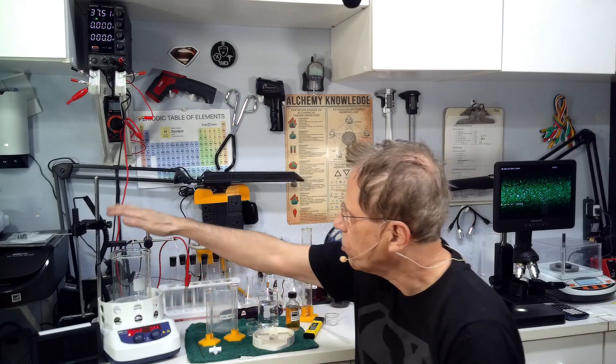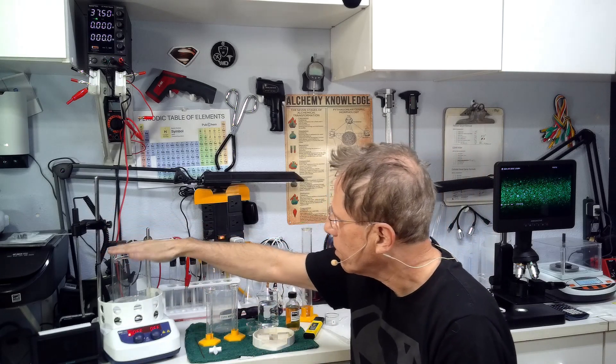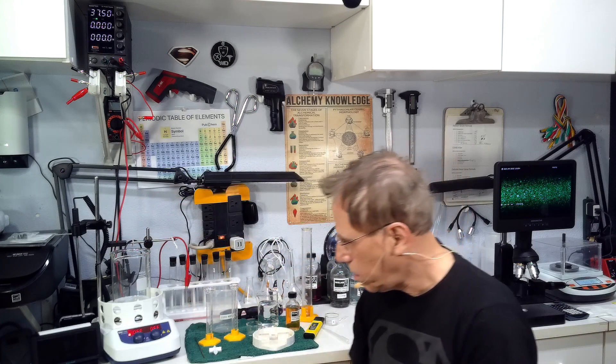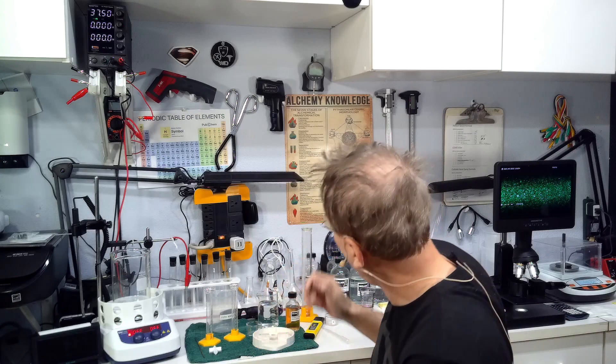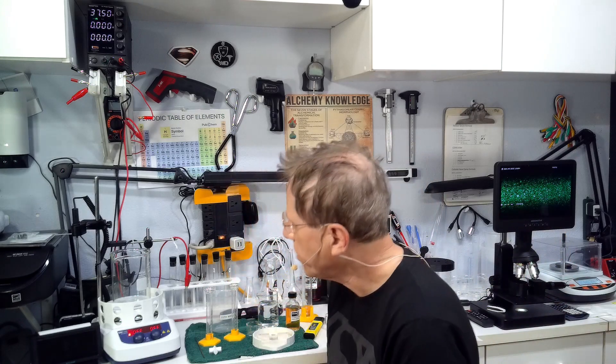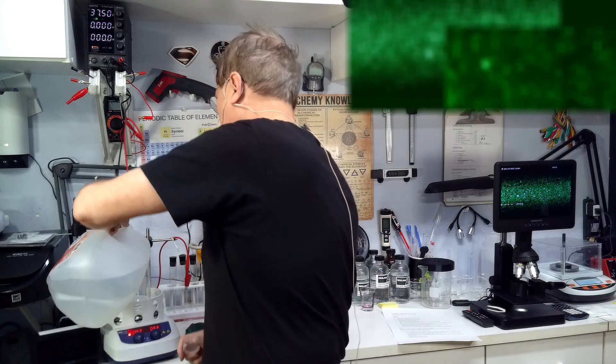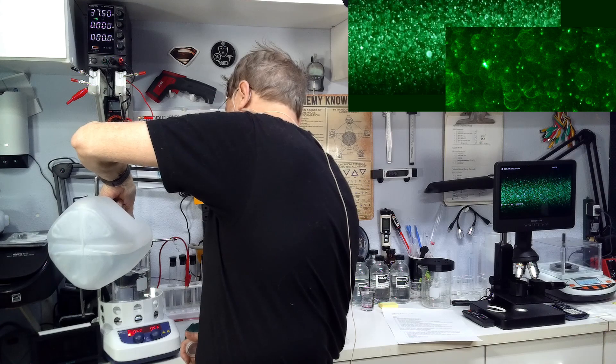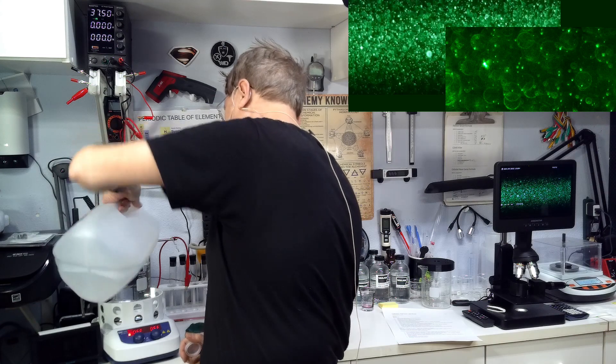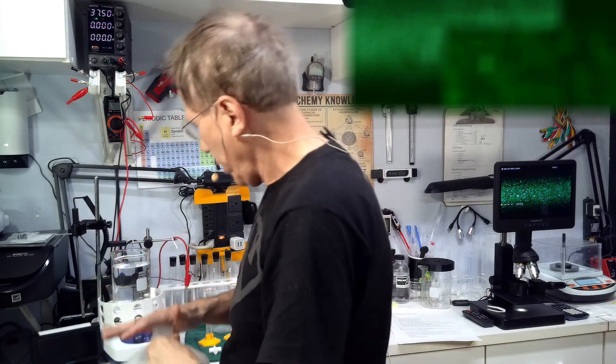We're going to start with 500 milliliters of distilled water. Over here on the video microscope, that is an eight to six to eight parts per million colloidal platinum, even though it doesn't look like it.